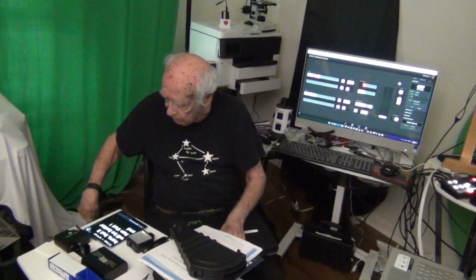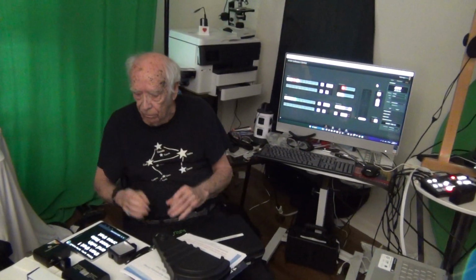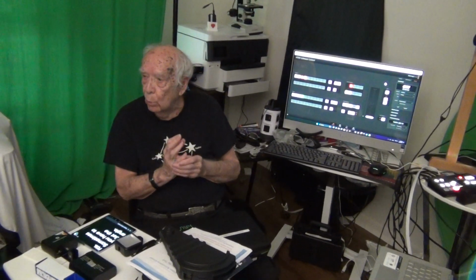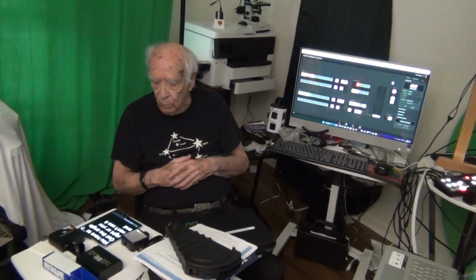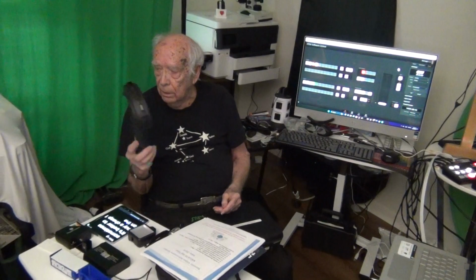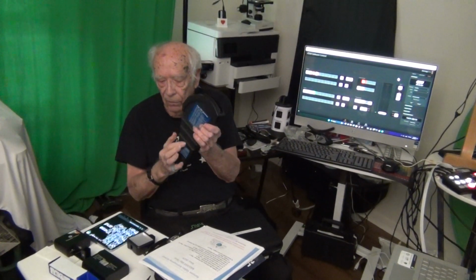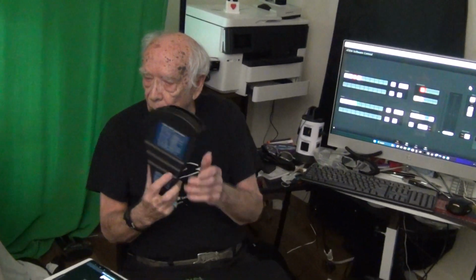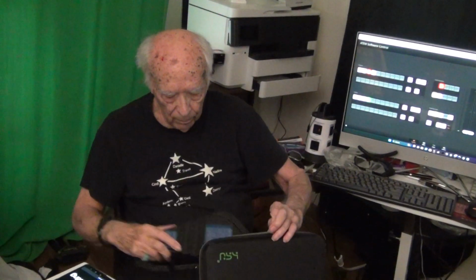And with these little ones that you make yourself, one she made out of a toilet paper roll, sometimes you have to get the angle right or you won't see it. And that's why sometimes it's better to buy a cheap one on the market. These are made, and then they have the wavelengths and the angstroms for what you're looking for there.